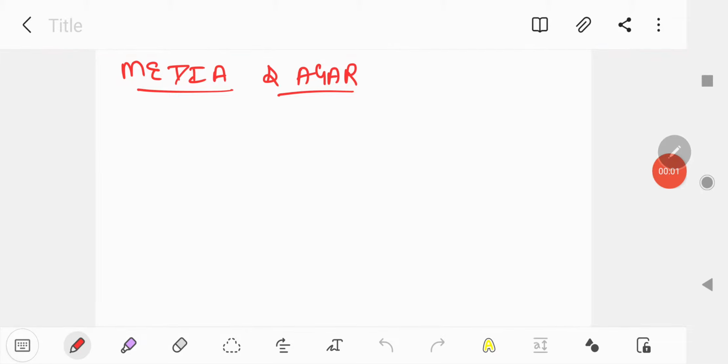Yes, so today we are starting with the microbiology for the second year, which is the main subject. And starting with this, first of all, I give the knowledge of differential media and agar. So, what is the media? Culture media, agar, and various selective media, enriched media. These are various media for which an organism is mainly the bacteria. So, first, I will tell about the culture media.